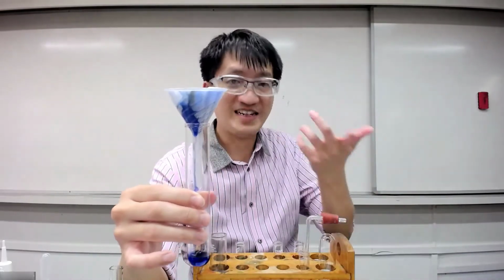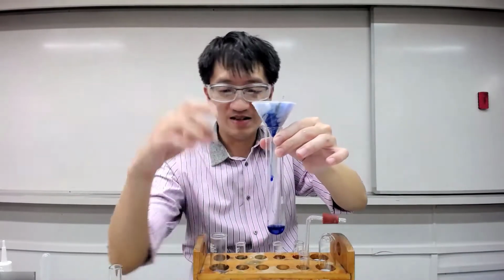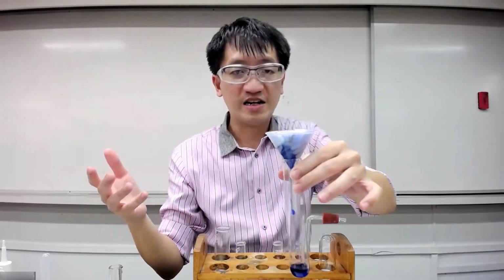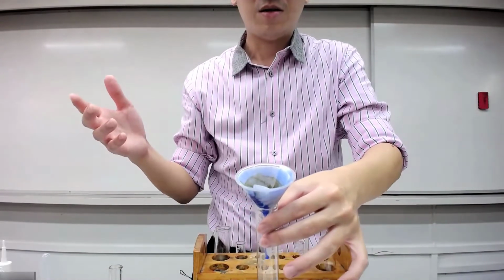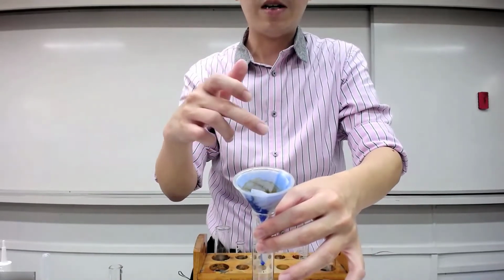Of course, in real exams, you don't hold it like that. In a real exam, you're just going to leave it here, right? But for now, I'm doing a demonstration, so I'm holding it. It's ready for you to see, and then I just want to show you a little bit. I hope I can tilt a little bit here. I don't dare to tilt too much. You can see a little bit of brown PPT at the side, right?